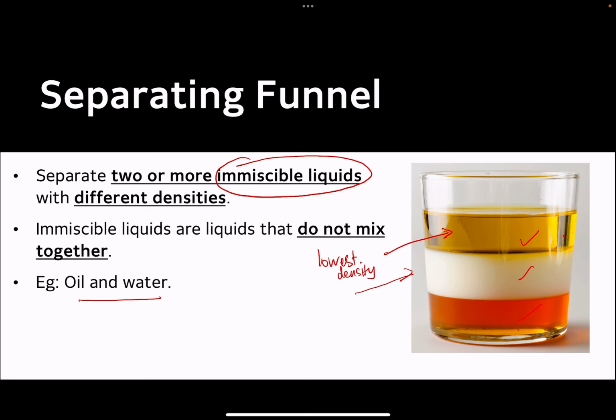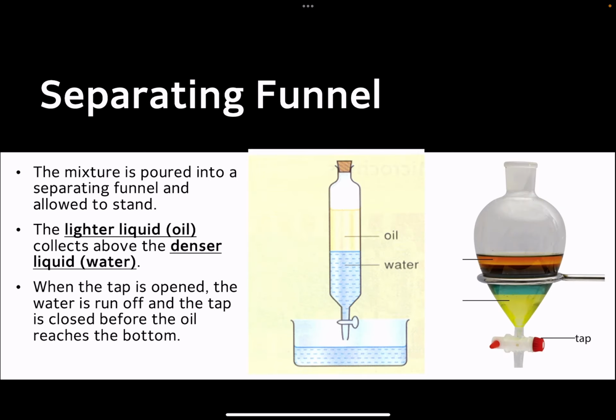So how does the separating funnel work? Let's take a look at this slide, and it will give you a better idea. I have a picture of a separating funnel over here. You get to try this in the lab as well. You just need to pour your mixture inside, from the top. Then you let it sit. You do not straight away try to separate them.